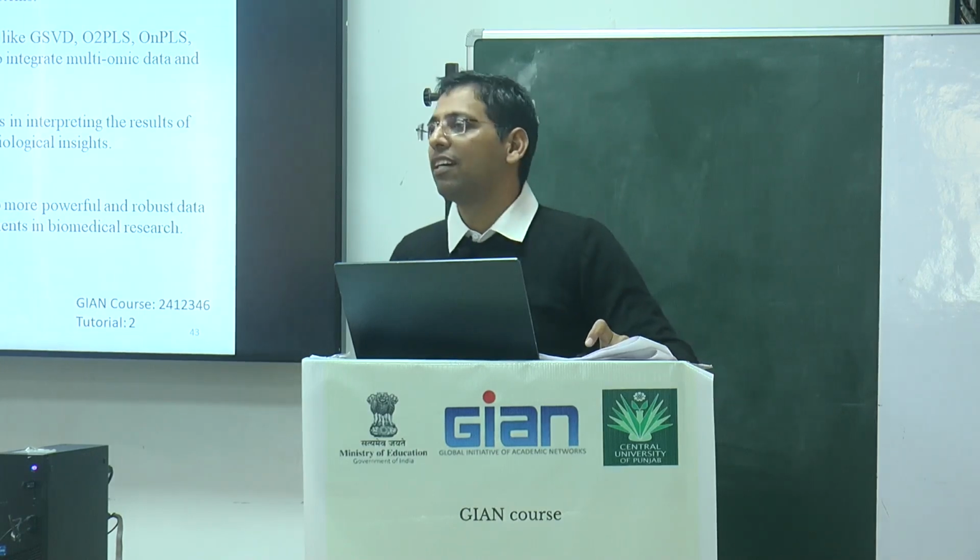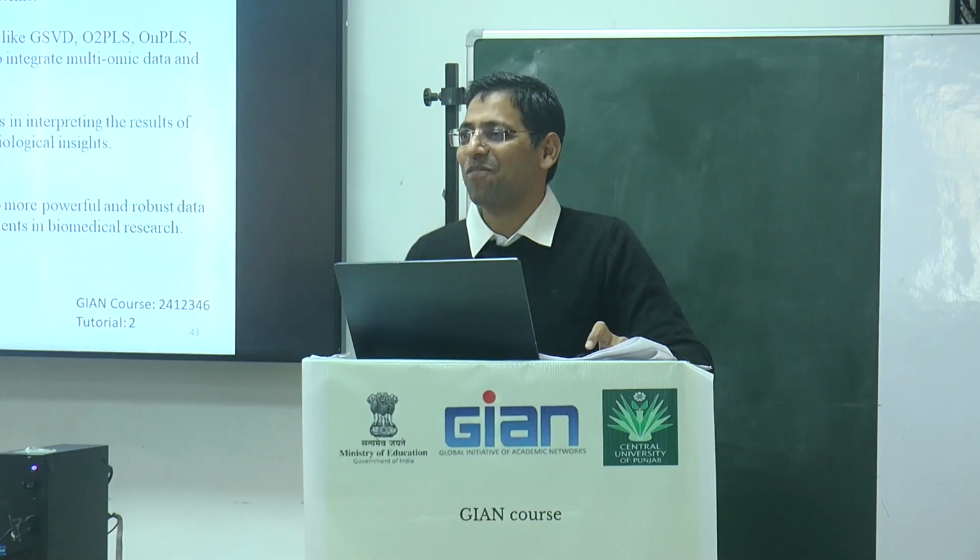Yes sir, go ahead. Yes, please speak. Can I ask something related to GCMS results? Yes, you can speak sitting down. Sir, in GCMS, sometimes in our observations, one compound can be found at different retention times. So what does it denote?